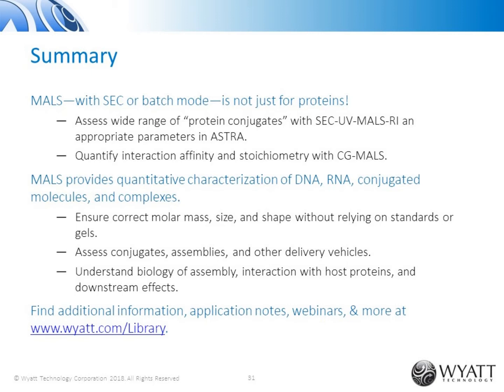And the fact that they are different for the protein and the nucleic acid lets us do that protein conjugate analysis that gives the amount of each species coming off of a peak. So what the value is doesn't influence how the measurement is done or the accuracy of the measurement, but knowing it is required for getting that molar mass.